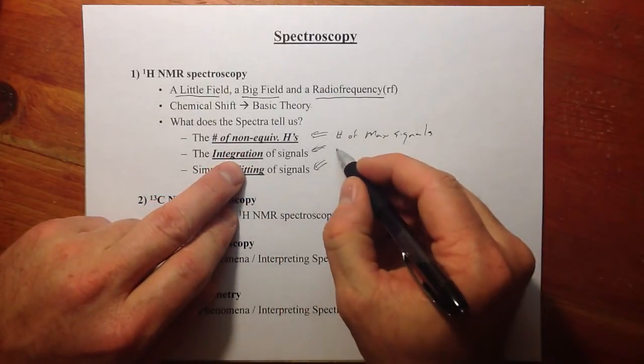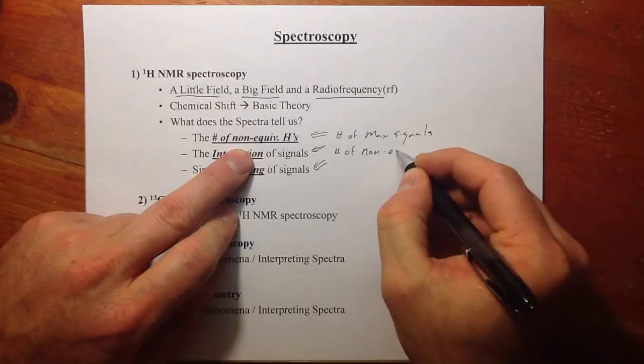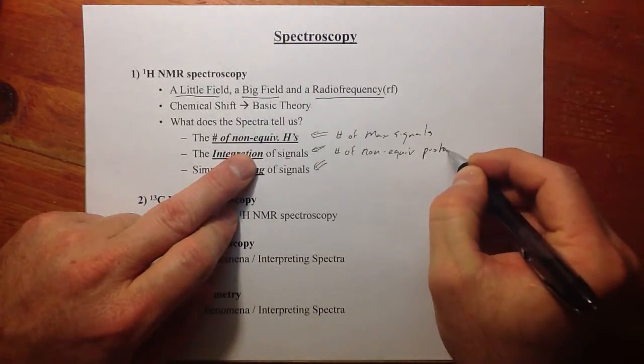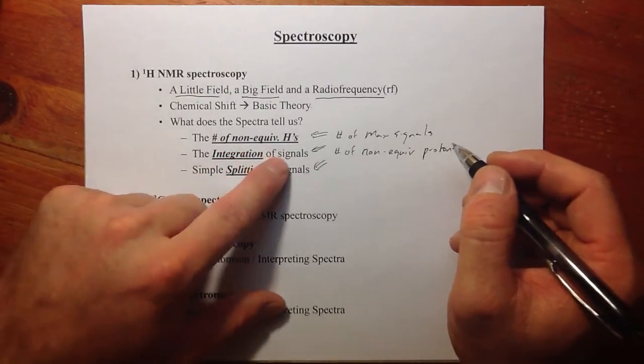Integration will tell us something about the number of these non-equivalent protons. So the number of non-equivalent protons will be reflected by the area under the peak, the integration of a signal, the area of a signal.